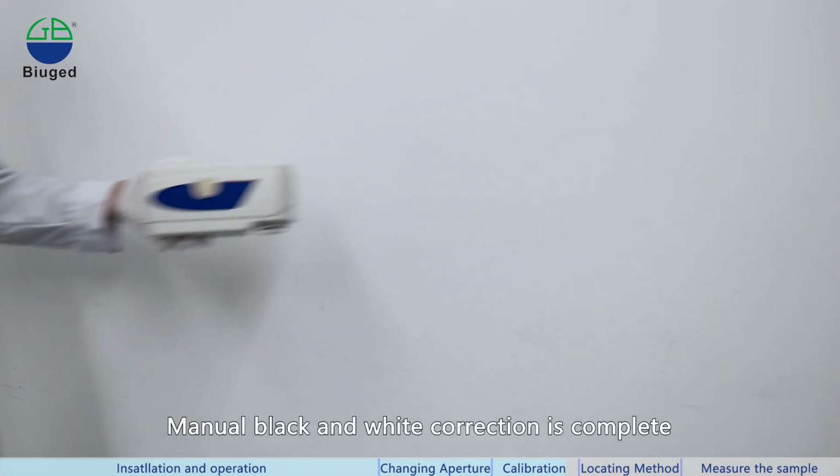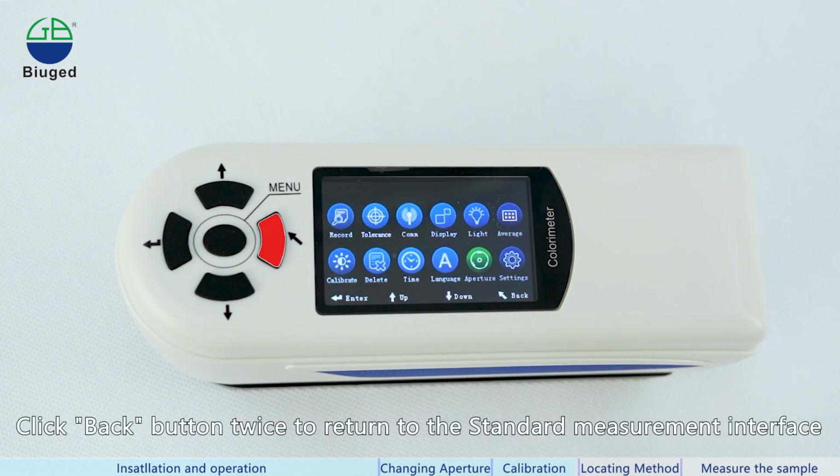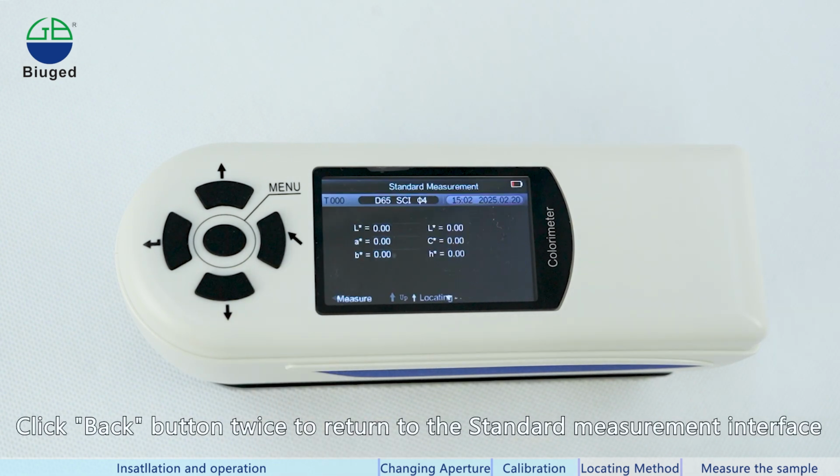Manual black and white correction is complete. Calibration is successful and it will return to the menu interface. Click the back button twice to return to the standard measurement interface.